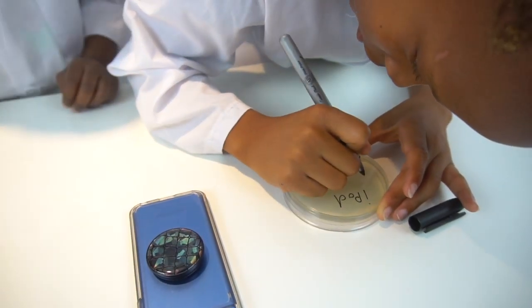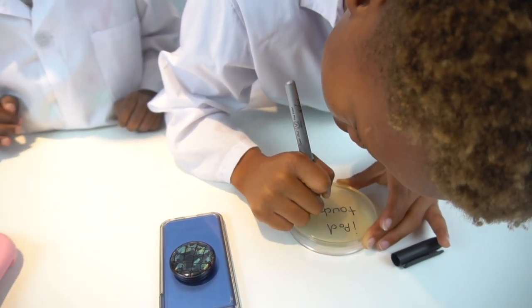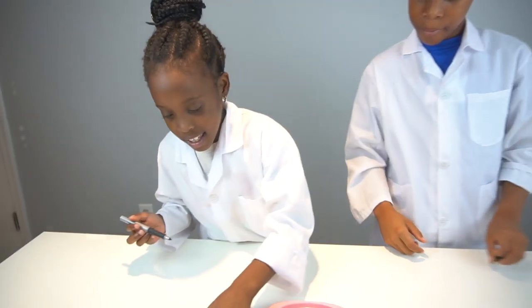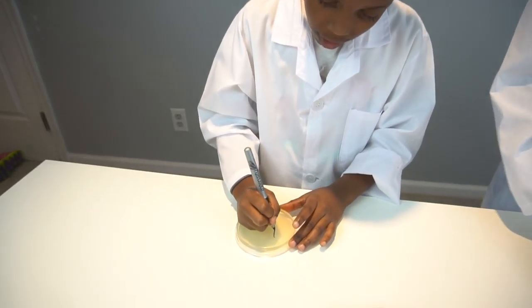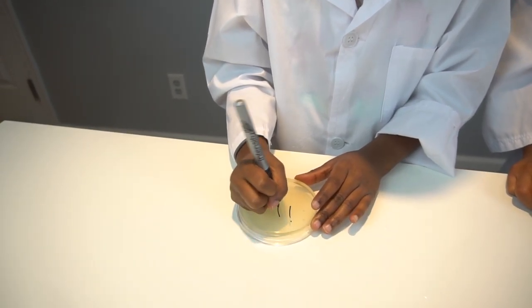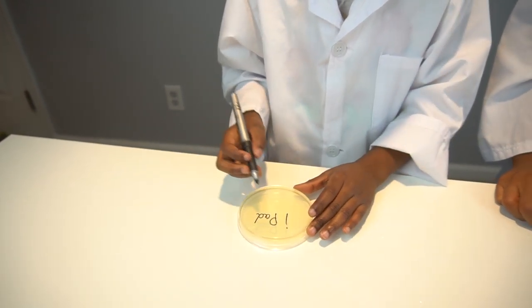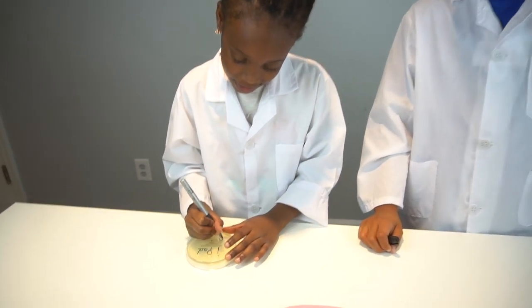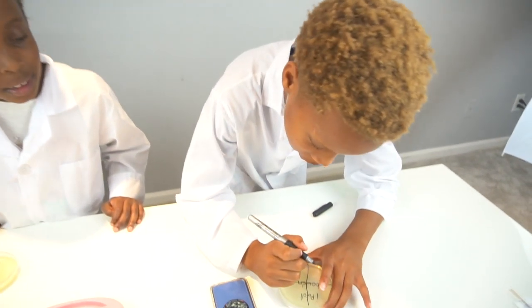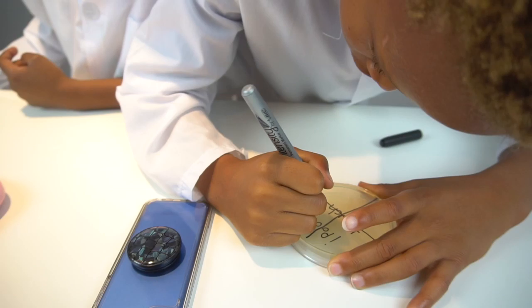We're labeling one dish iPod Touch and the other iPad. Now we're going to apply the sample just like this, using the cotton tip to swab.